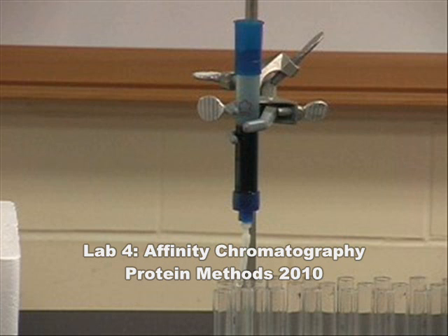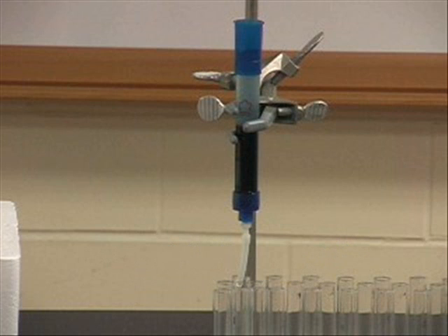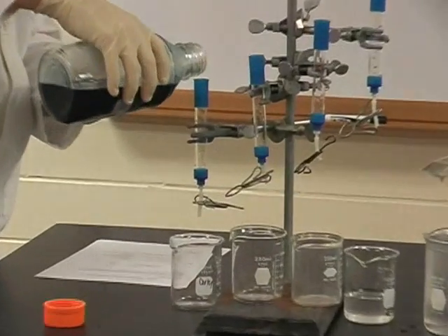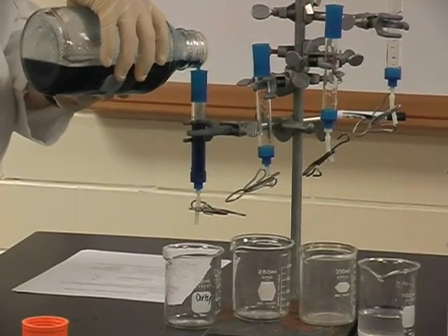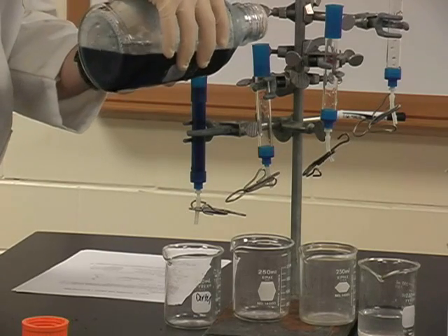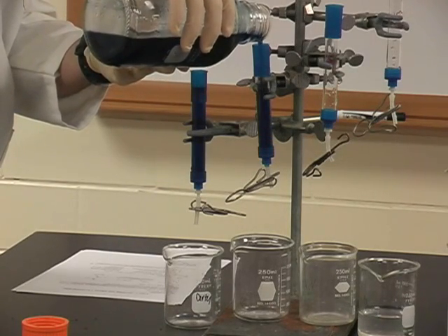Today we will be discussing Lab 4 Affinity Chromatography. In this lab we will be using Cyprochron Blue F3GA dye bound to an agarose bead to separate out the lactate dehydrogenase in our sample from the other bulk proteins in our sample.